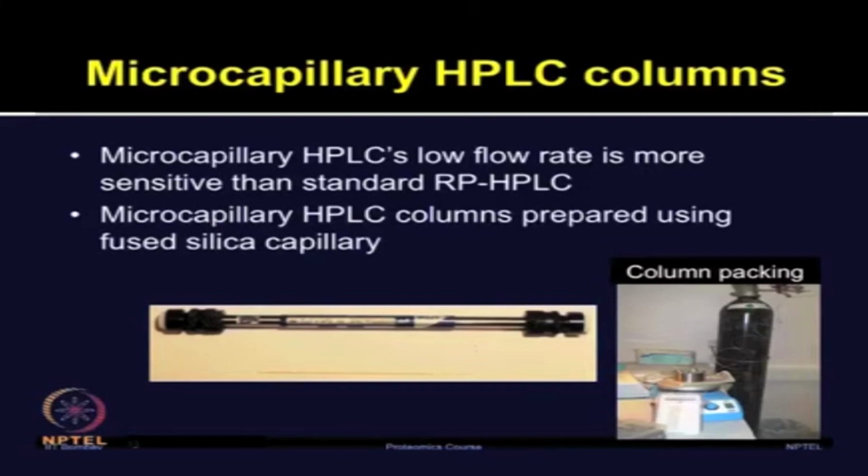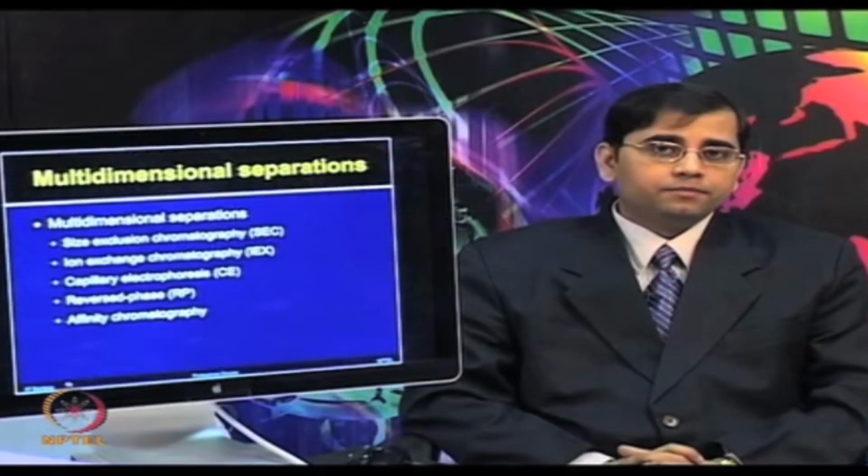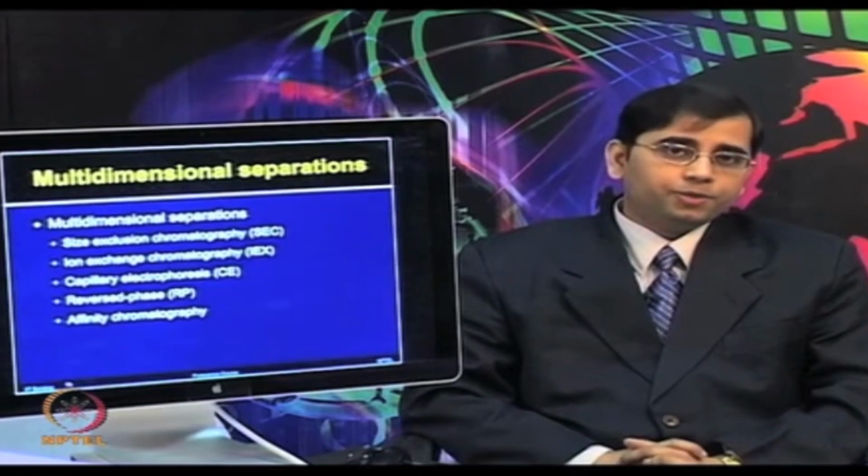The microcapillary HPLC is required for the analysis of low femtomole amounts of peptides. One can prepare microcapillary HPLC columns by using fused silica capillaries and packing them with reverse phase packing material. For pre-fractionation, multi-dimensional separations are used.